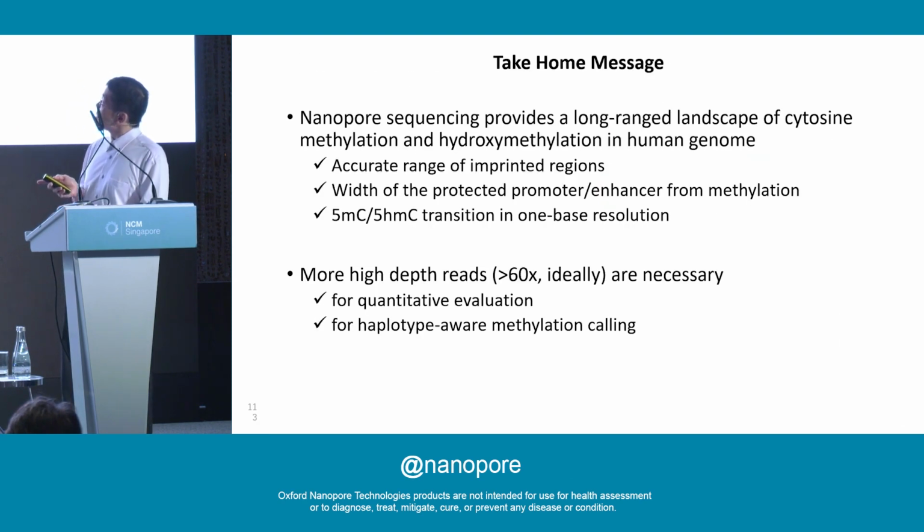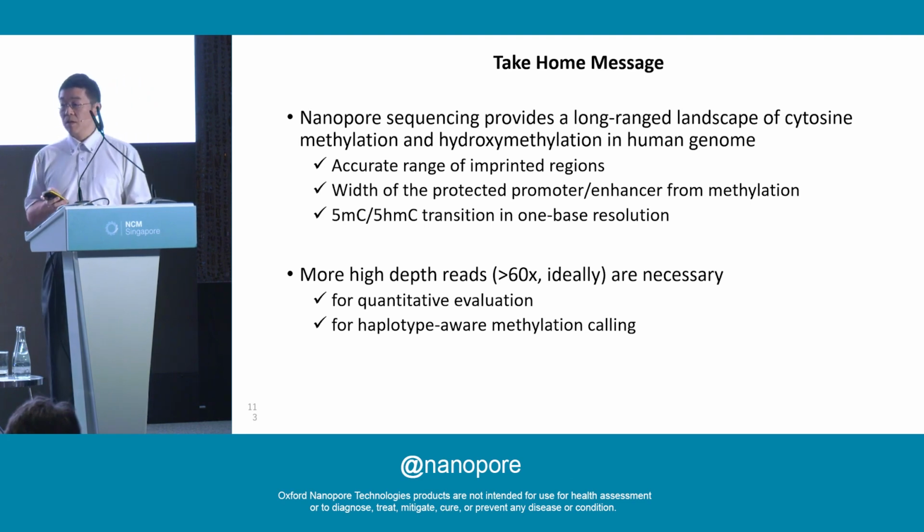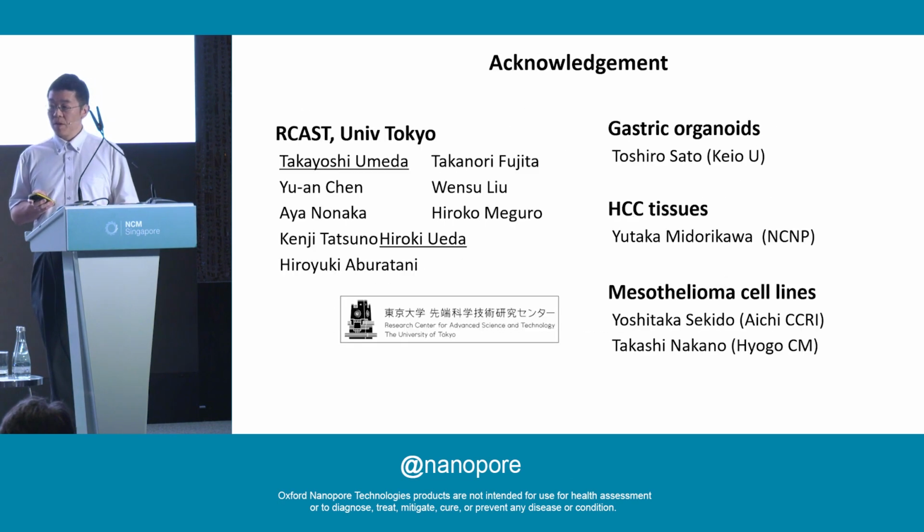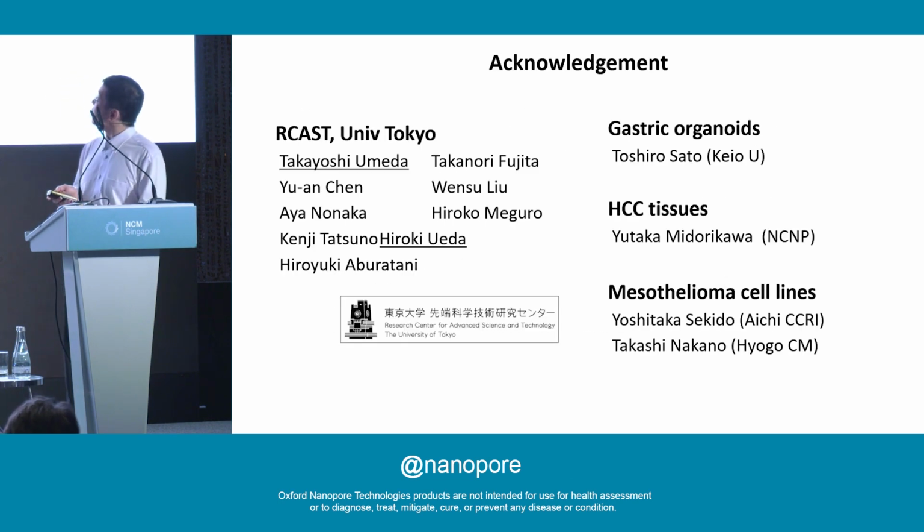So this is my take-home message. Nanopore sequencing provides a long-range landscape of 5-mC and 5-hmC in cancer genomes, and higher-depth reads are necessary for quantitative evaluation.